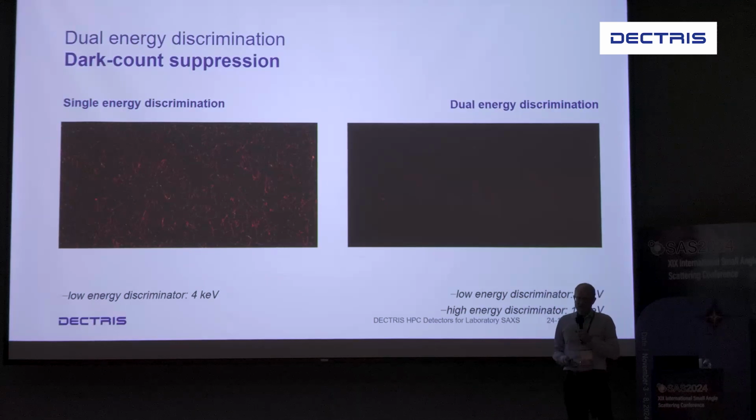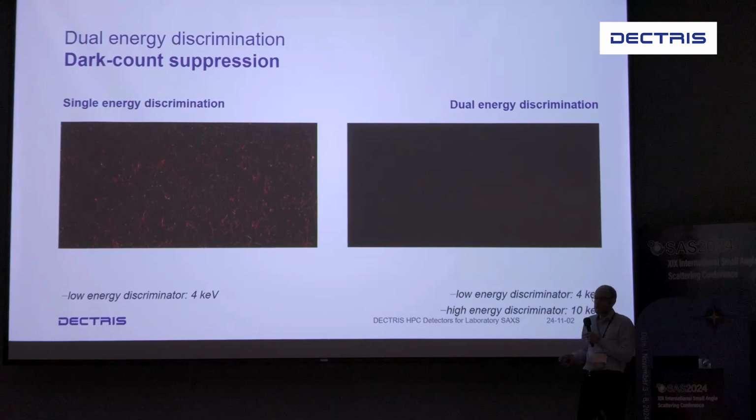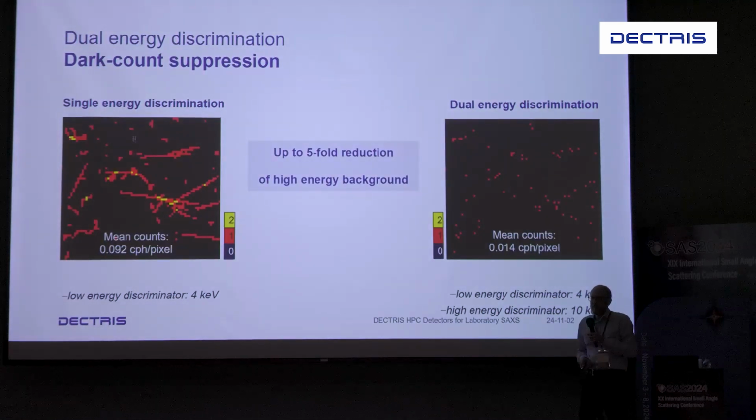The HPC detectors do not have any detector background, and in addition to that, you can also suppress the environmental background. EIGER 2 and Pilatus 4 have 2 or more thresholds per pixel. So in addition to the low energy background suppression, you can also suppress the high energy background. That's exemplified here. With single energy discrimination, you see the high energy background, and with dual energy discrimination, you can subtract that and substantially reduce that by a factor of up to 5, which is particularly beneficial for CD-SAXS with long measurement times, weak signals.